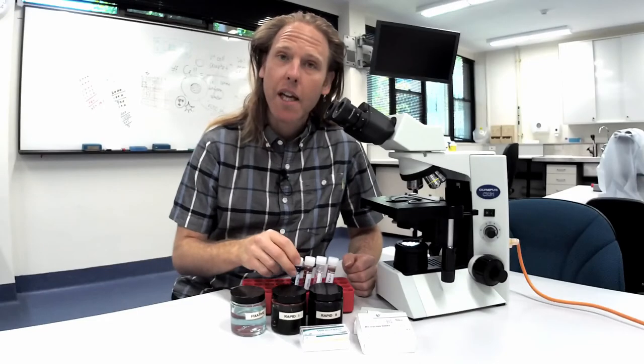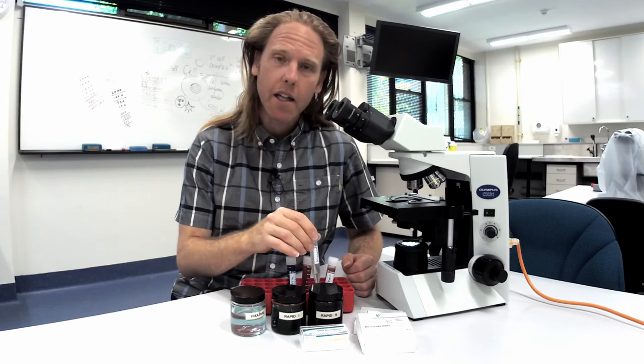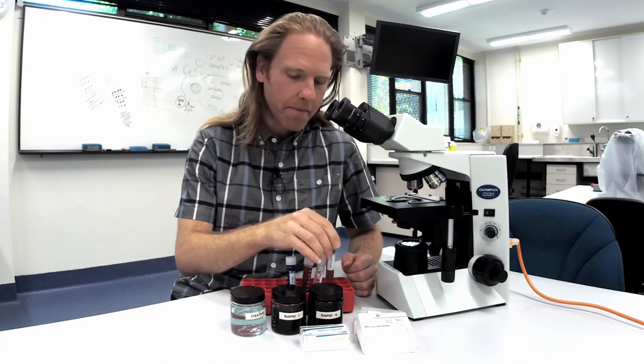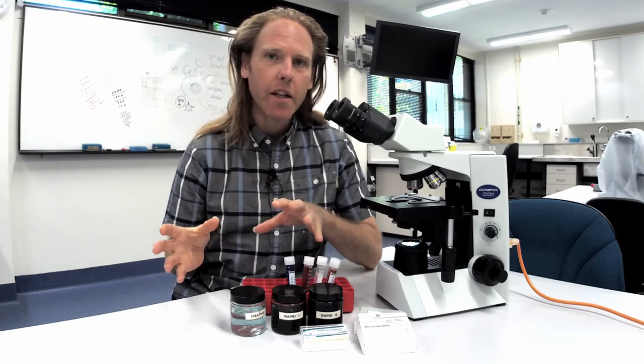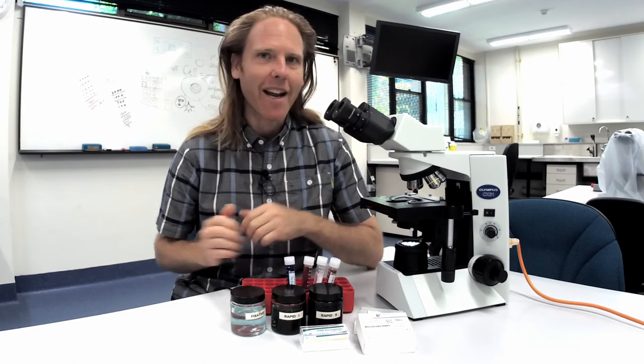The gram stain consists of crystal violet, iodine, a decolorizer and saffronin. Gram positive bacteria stain up deep violet to purple and gram negative bacteria stain up pink to red.